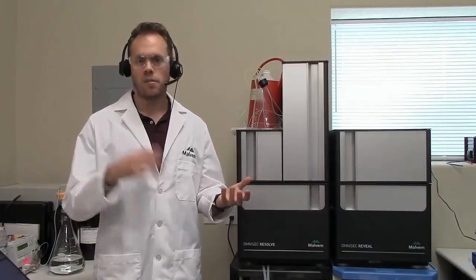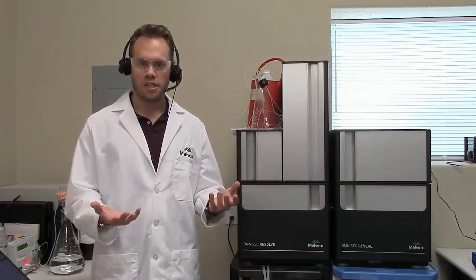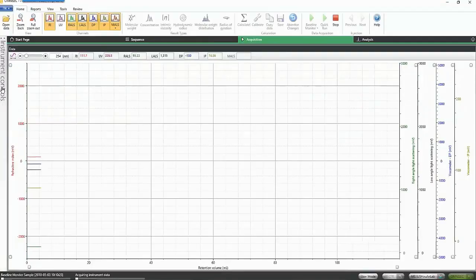And what we're going to do, in order to go from PBS to THF, we're going to switch from PBS to pure water. We're going to purge out all the detectors, make sure we've got that whole system nice and cleaned out and removed all the salts, so there's no chance of any precipitation within any of the lines. And then once we're in pure water, then we'll switch over to THF. So let's do the water switch first. And to do that, simply stop the flow.